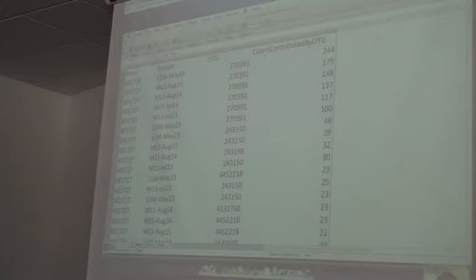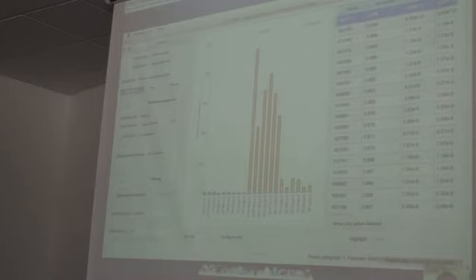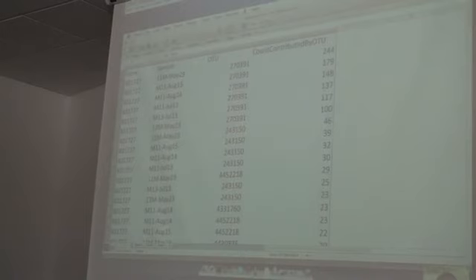So what this information tells you is that we saw in here that the middle age groups range from, say, 200 to 400, depending on the different samples. And when we look at this table now, we can say that this OTU is contributing a lot of the signal across these different samples.